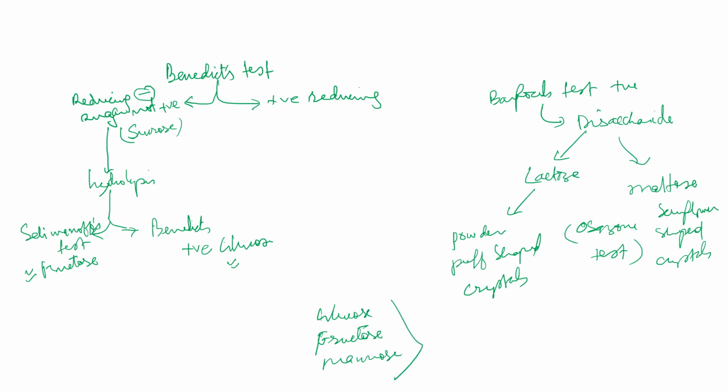They all give the same osazon. They give needle-shaped crystals or broomstick appearance.